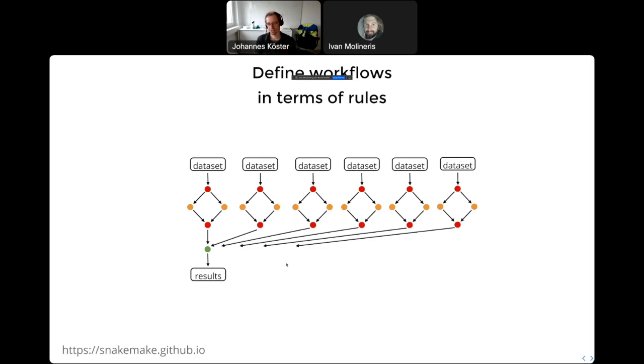So there's a disconnection often in practice between the workflow and this last mile data analysis, how I like to call this. And today I want to show that this is actually not necessary, and that Snakemake offers, via this tight integration with notebooks, but also some other technologies, some capabilities that allow you to conduct the analysis from the start to the end in the same system. And this has a lot of advantages.